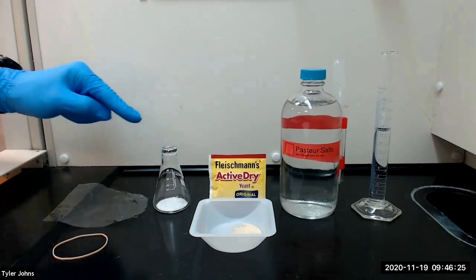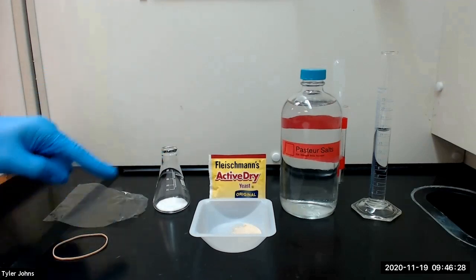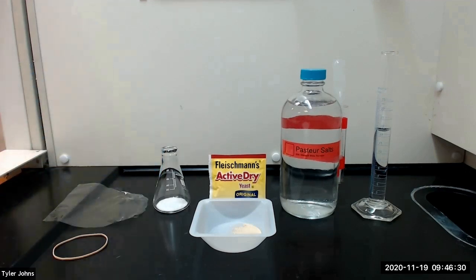We will then cover the flask with plastic wrap and a rubber band and allow the solution to ferment in a 30 degrees Celsius incubator for approximately one week.